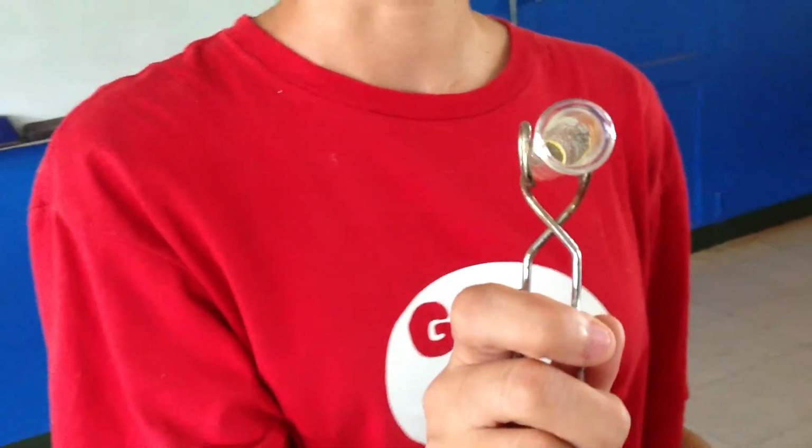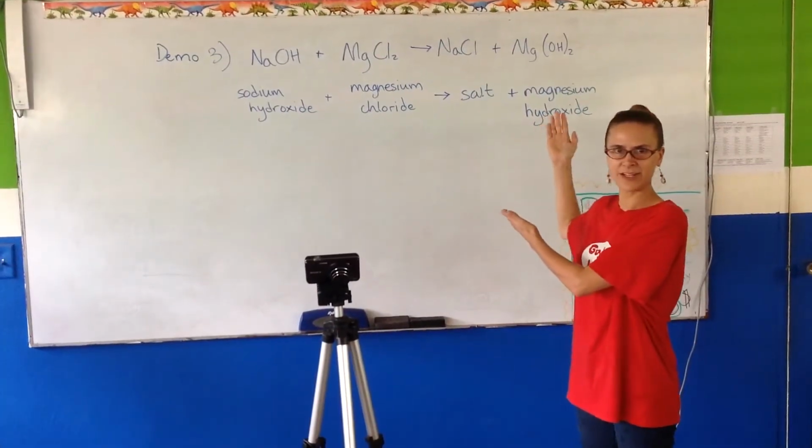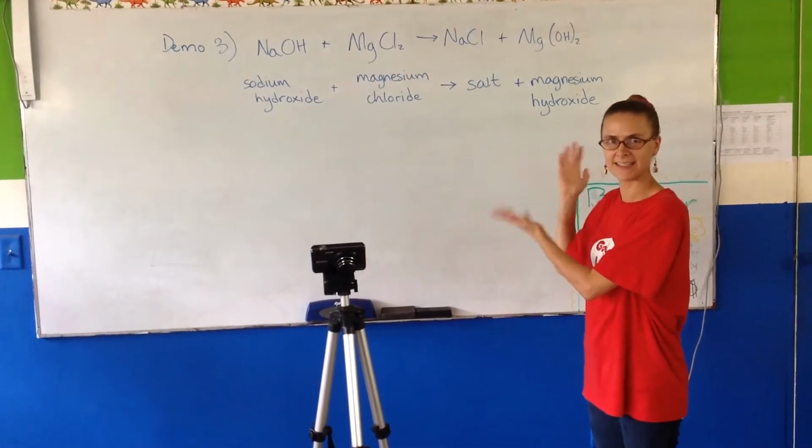There it is. That's the end of demo 2. This is the chemical equation for our third demonstration. Please write it down and let's begin.